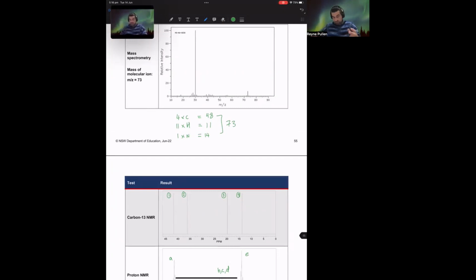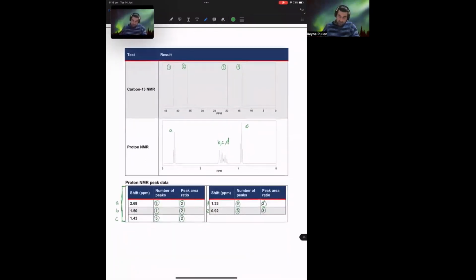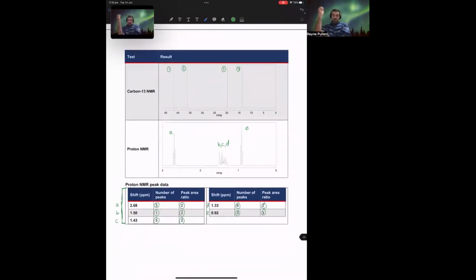Once again, the pieces are coming together. So this confirms for us that our assumption that there is a nitrogen is feasible. So let's have a bit more of a think about how we can propose a structure. Now, what we've seen in this carbon NMR is that the peak 1 must be closest to the nitrogen. It is the most de-shielded, but then we see effectively a stepwise movement back towards 0.